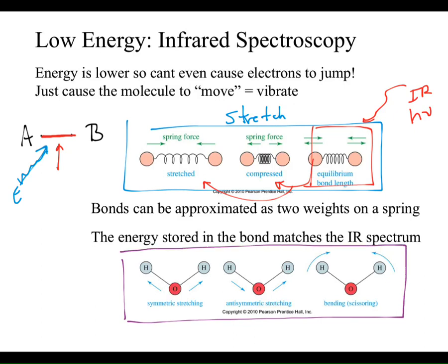And that's what's being shown on the bottom. You can get something known as symmetric stretching. Both of those hydrogen atoms are pulling away from the oxygen at the exact same instant, and then of course coming back at the exact same instant.